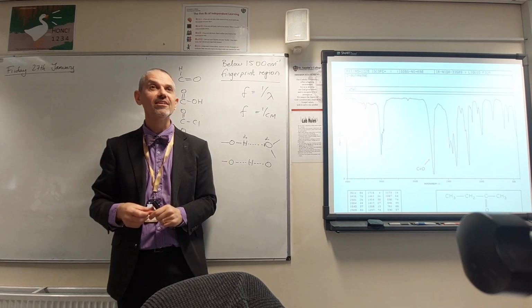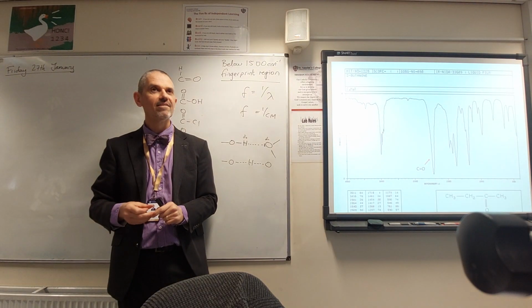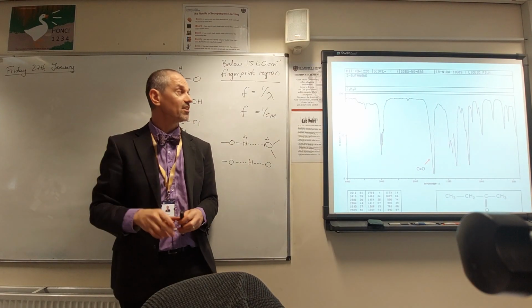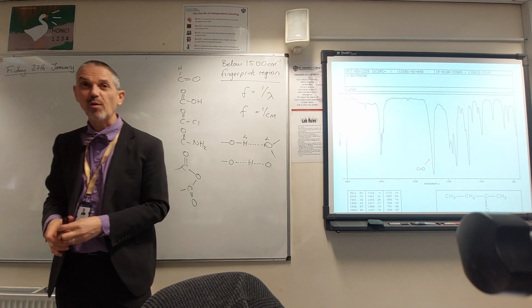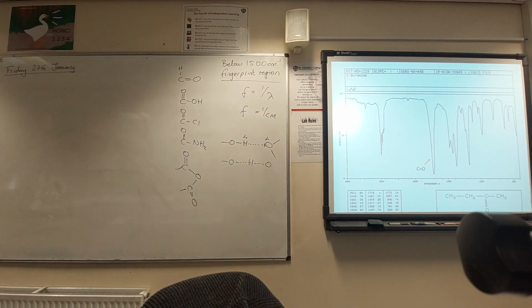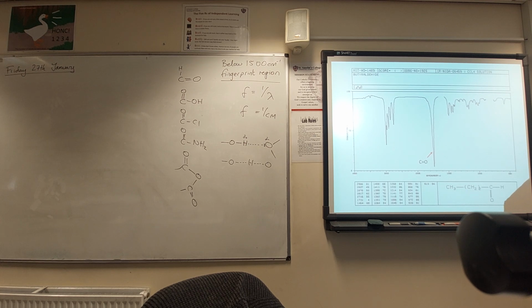Any ideas? Yeah, it's water. It's probably just ever so slightly wet. Of course, a very, very tiny amount of water. Given that you often only analyse milligrams of sample anyway for infrared, a very tiny amount of water, given that OH absorbs so strongly, will often get onto our spectrum.